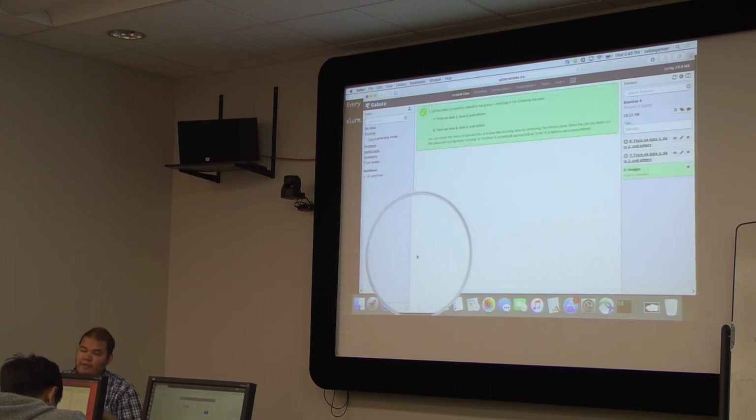Even though we have 2 images, because we only downsample them by a factor of 5, how much is 5 choose 2? 10? Right? 5 choose 2 is 10, and it should take a couple of minutes. So training this model will take about 10, 15 minutes. But we don't want to sit down and wait.